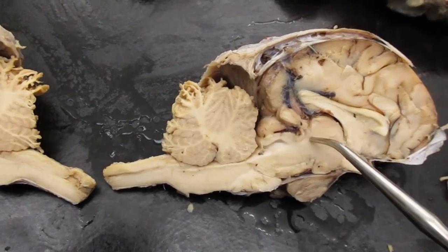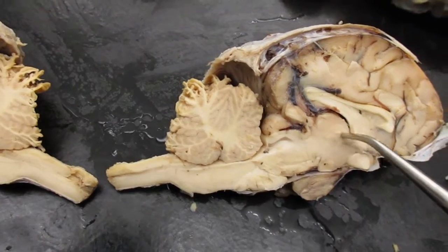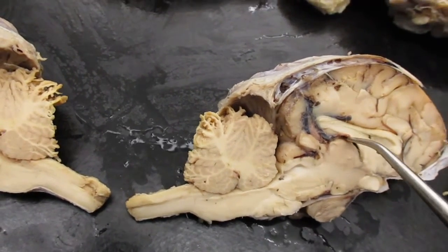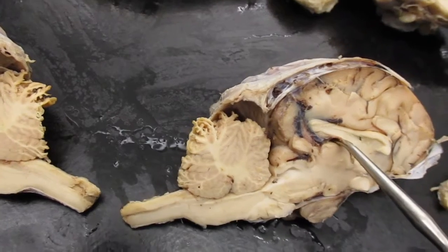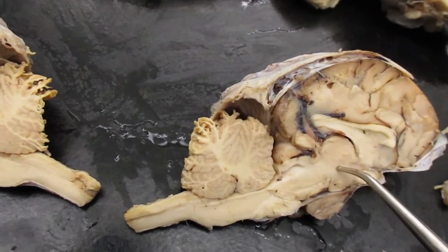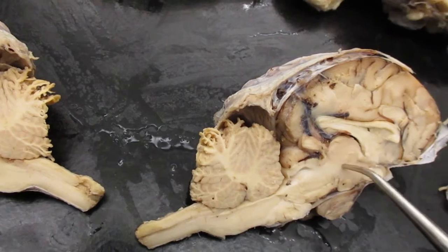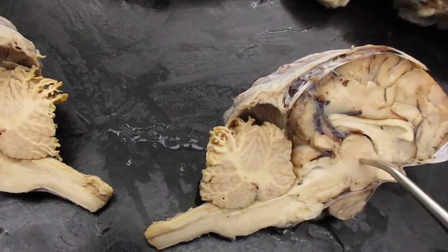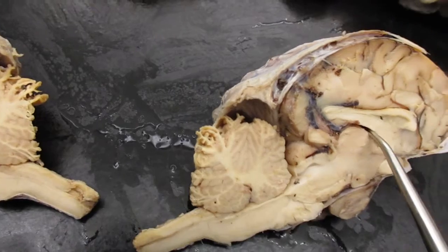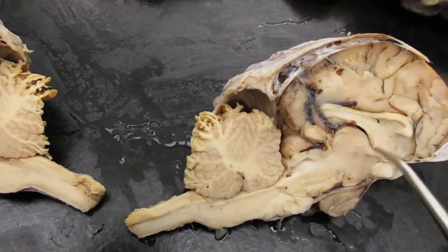This structure right here looks like a ball. Sorry, this structure underneath the interventricular foramen is called the thalamus. This is the thalamus that the probe is circling. Interventricular foramen right here.